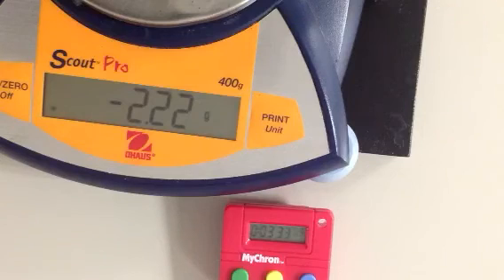It's 3 places. Are you guys breathing? No. None of that breathing stuff. You're messing up our balance, okay? If I breathe, shouldn't it go up? Yeah, breathing on the balance. You will. When you go to college, you'll get a 4-place balance you get to use. That'll be in a special room, which is anchored to the foundation of the building, and you have little doors on the balance you close so the wind doesn't mess with it, because at 4 places past the decimal point, breathing messes with the balance. Okay.